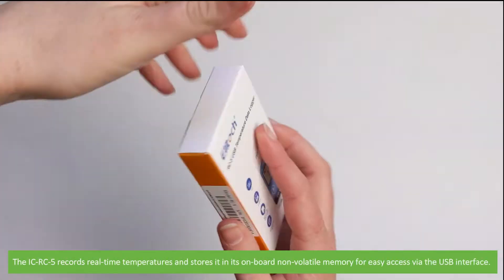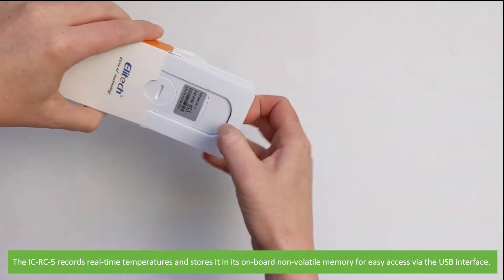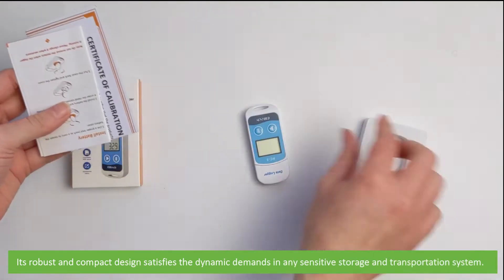The ICRC5 records real-time temperatures and stores it in its onboard non-volatile memory for easy access via the USB interface. It's a robust and compact design, satisfying the dynamic demands in any sensitive storage and transportation system.